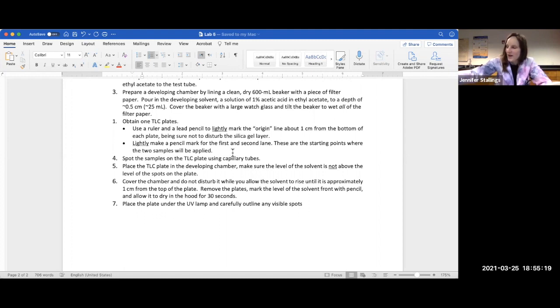However, I only have a finite number of, is it finite? Yeah, finite, not infinite. So I only have a limited number of TLC plates, and that's all I could find in the stockroom. So hopefully I can do this experiment once, maybe twice, and not use up all my TLC plates and get the results that I hope for.